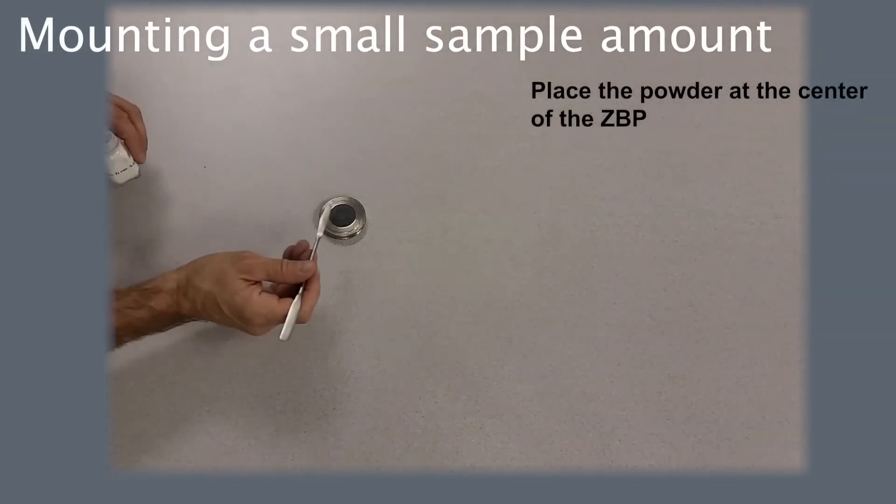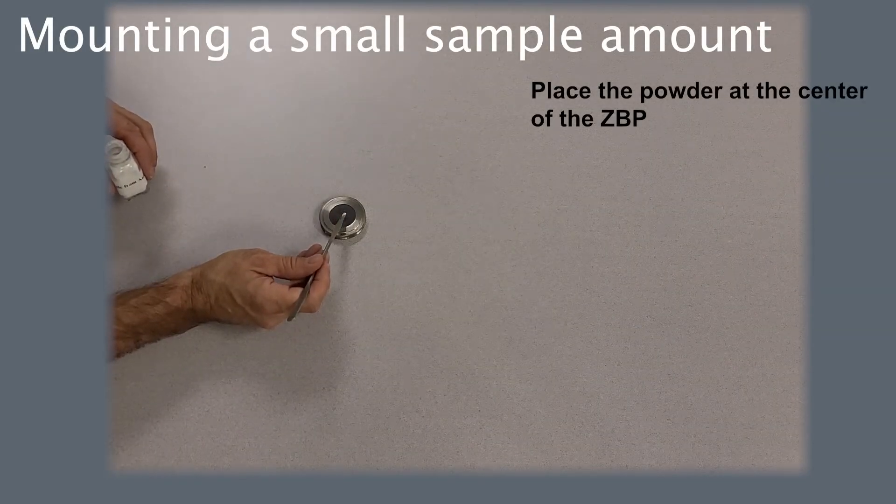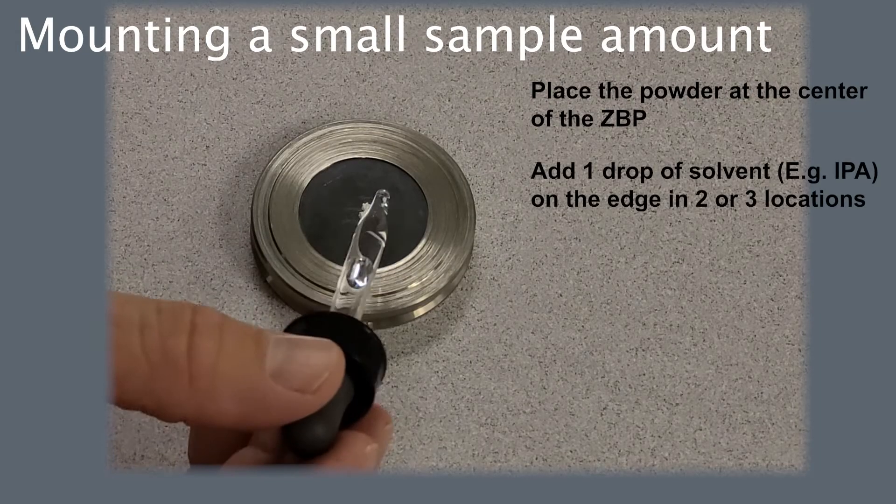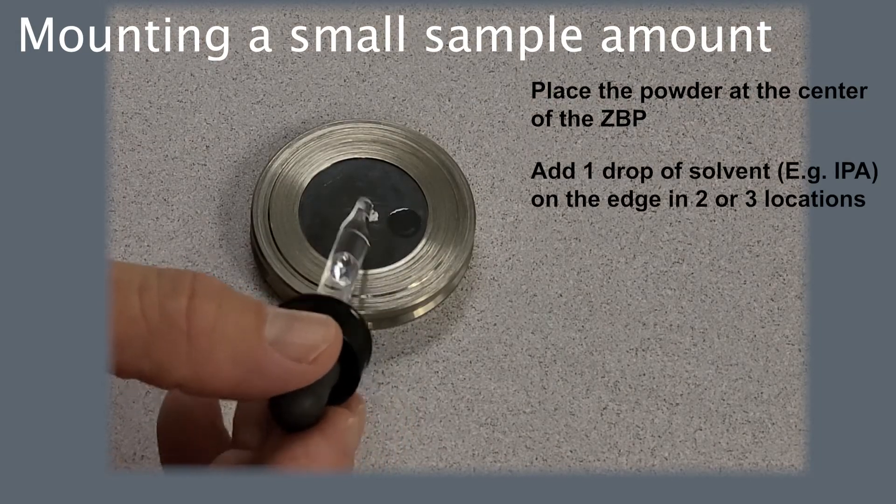To mount a very small powder sample, place the powder at the center of the plate, then add a drop of solvent in two or three locations around the sample.